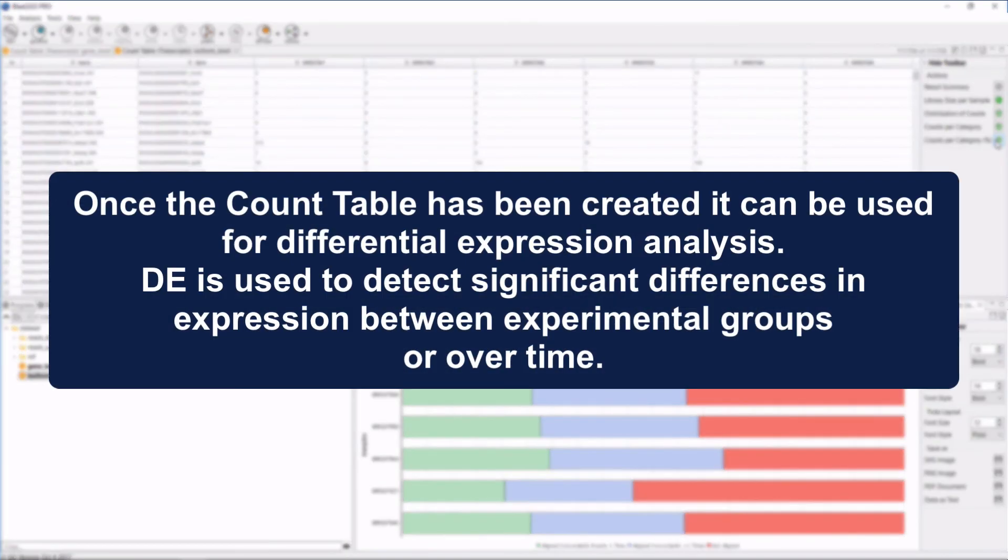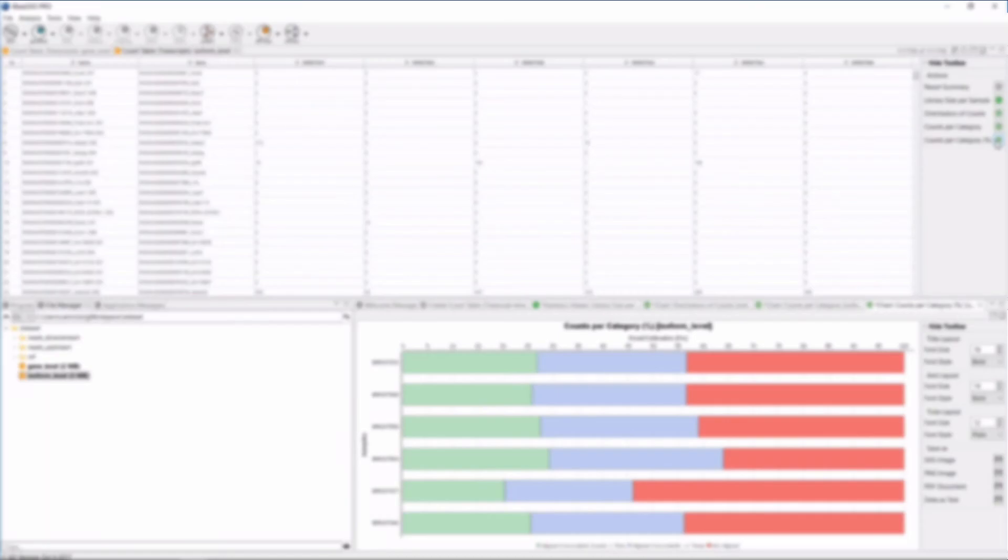Once the count table has been created, it can be used for differential expression analysis. Differential expression is used to detect significant differences in expression between experimental groups or over time.